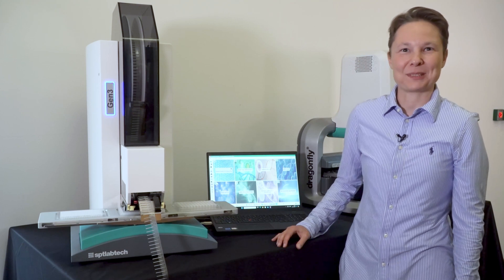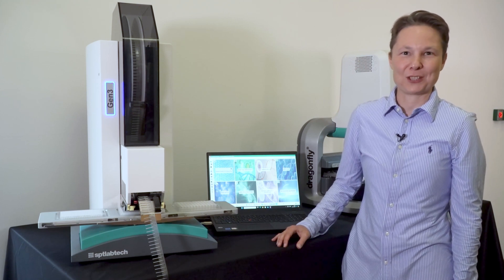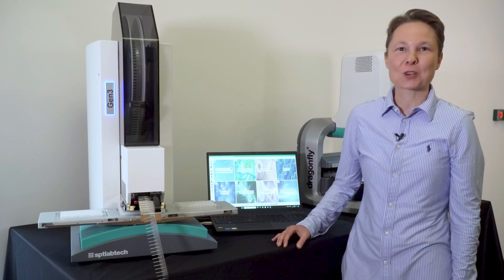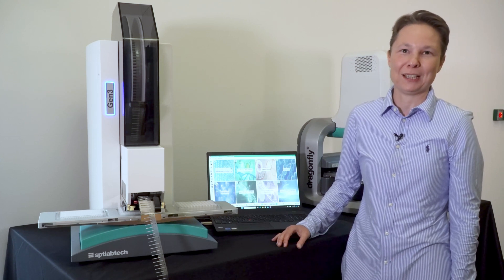Hi, I'm Kamila Kofroska from SPT Labtech, Product Manager for Mosquito Genomics. I'm really excited to introduce you to our latest, most compact and accessible member of the Mosquito Genomics family.